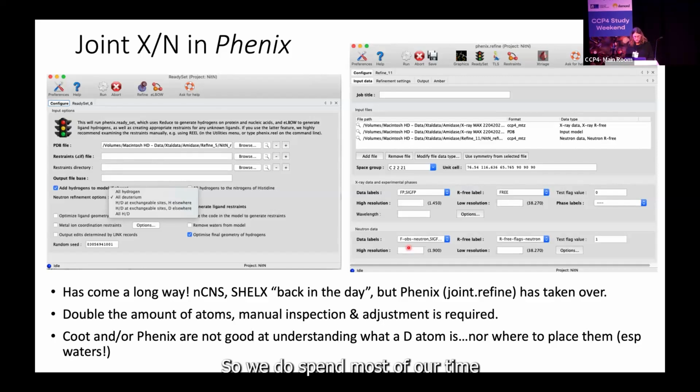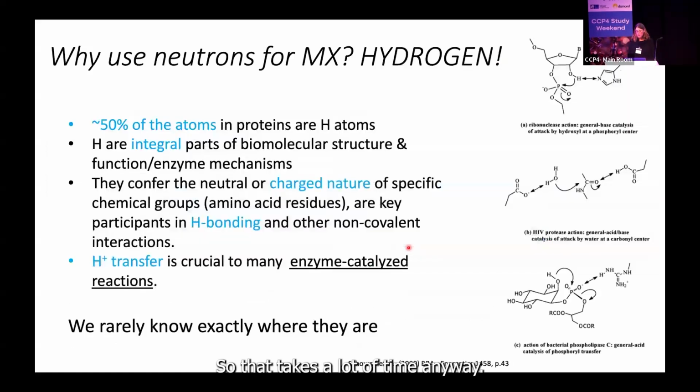So we do spend most of our time doing manual inspection and adjustment, which is extremely tedious since you now have double the amount of atoms. So waters are not just oxygen anymore, they are now times three the number of atoms to take into account. So that takes a lot of time.